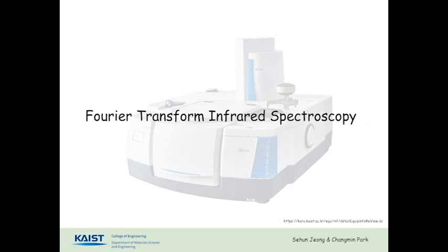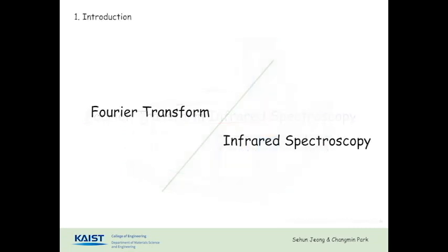Hello, we are KAIST students taking MS310, Introduction to Quantum Chemistry, and we will explain Fourier transform infrared spectroscopy, called FTIR. The photo behind the title is a real FTIR in KAIST color. The word FTIR means infrared spectroscopy using Fourier transform.